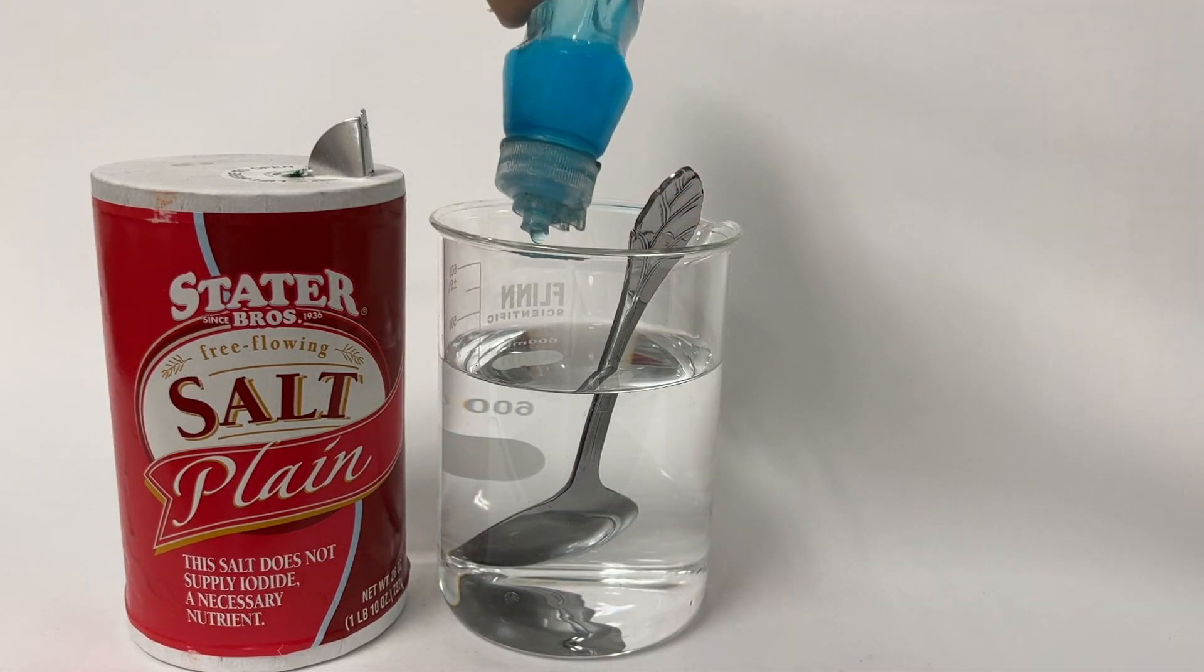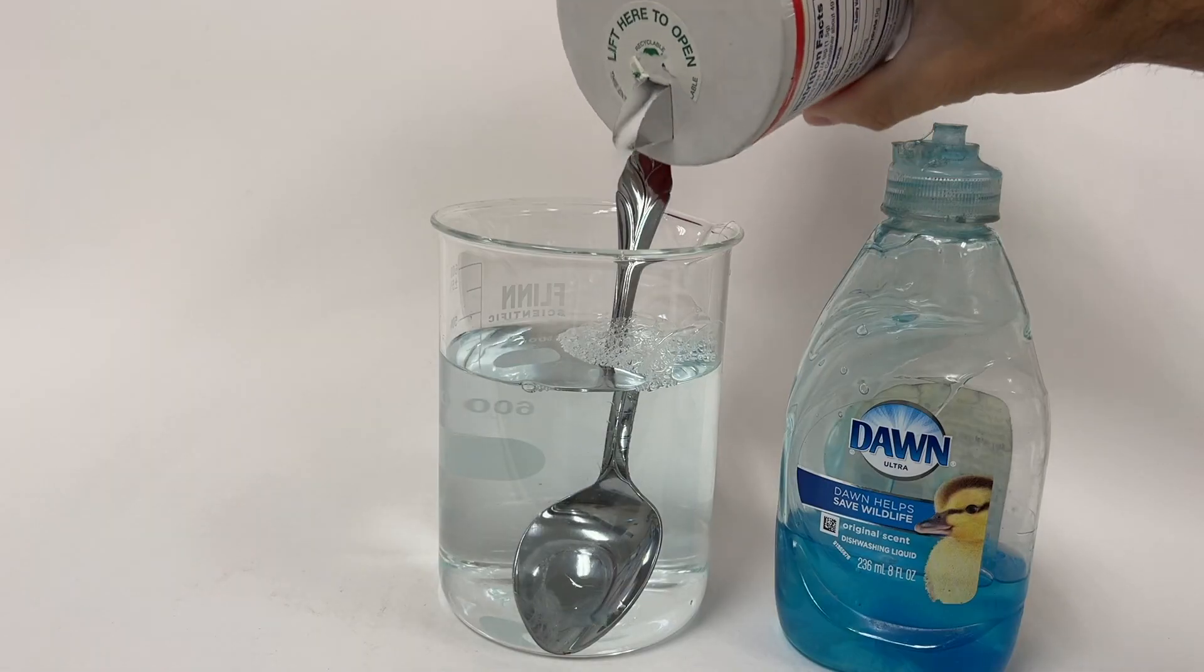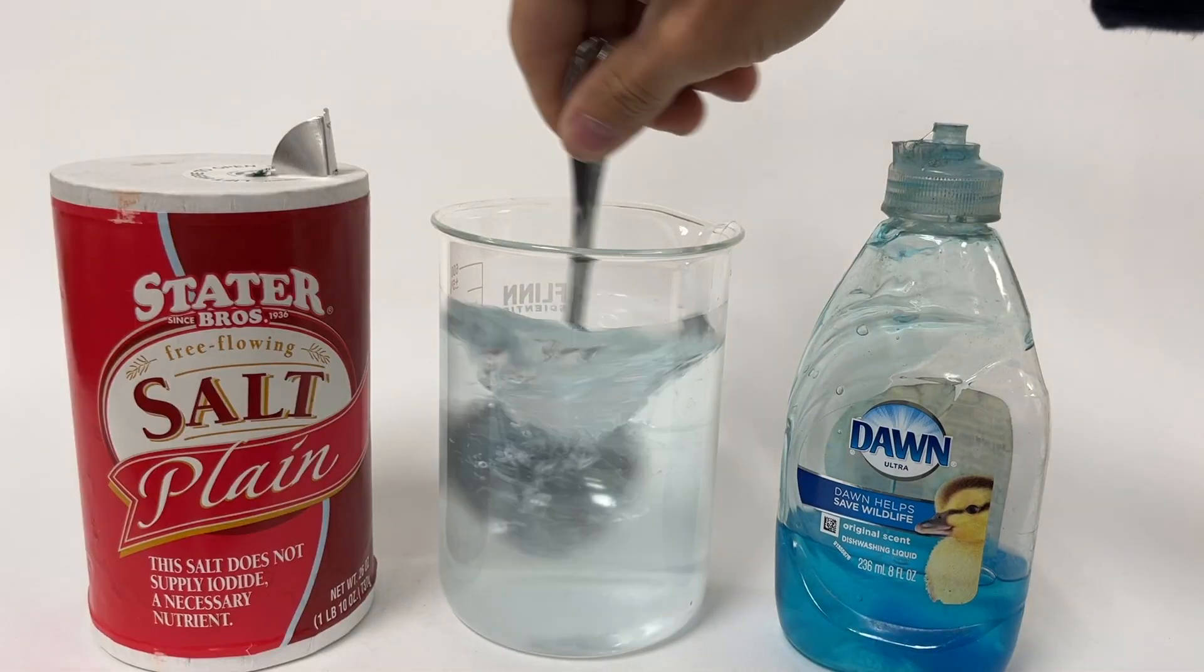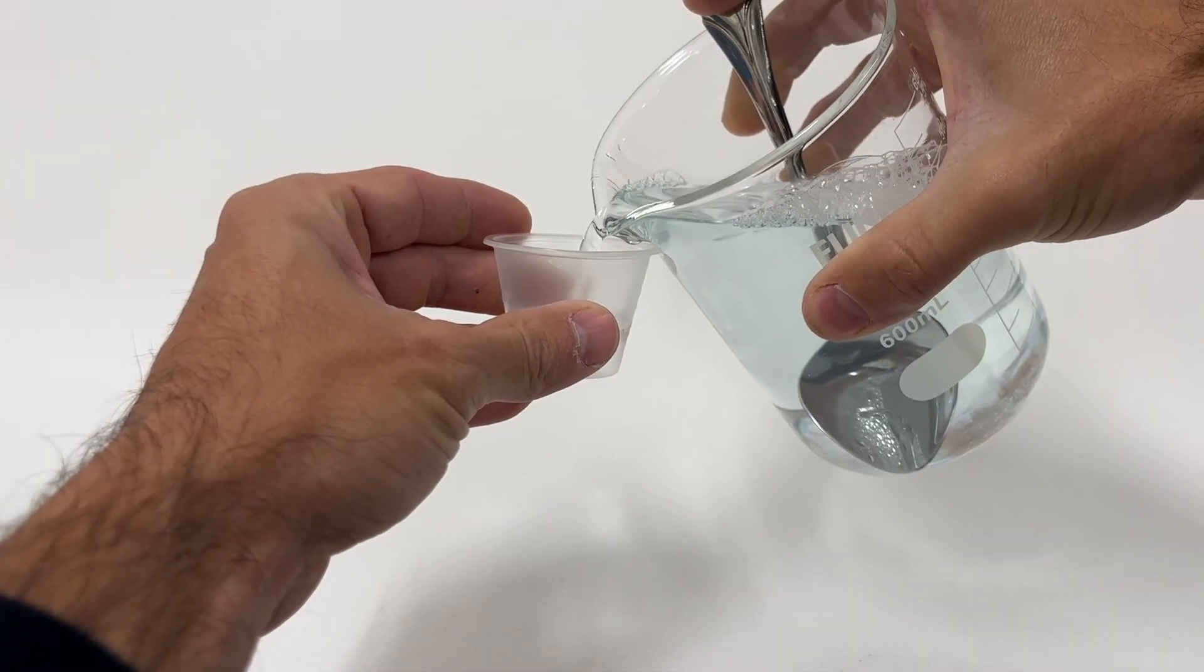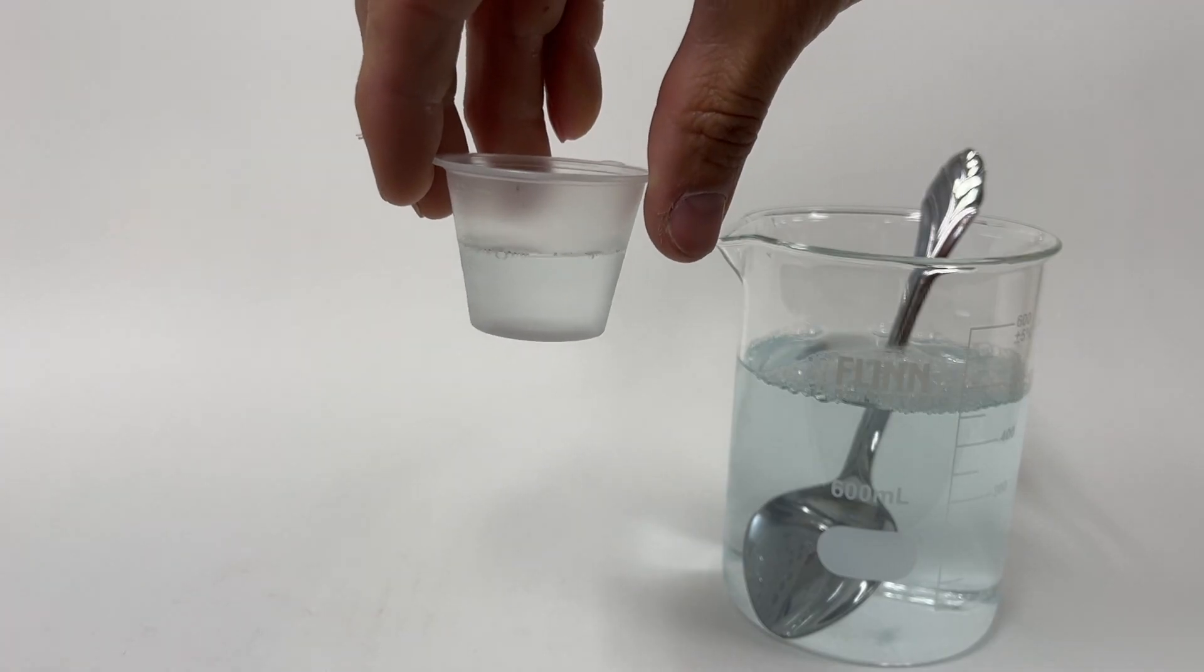Next, make a soapy, salty solution by adding soap and salt to some water and mixing it up. No need to measure exact amounts, just pour a little of each in and mix it right up. Each group will need about 20ml of solution for the lab.